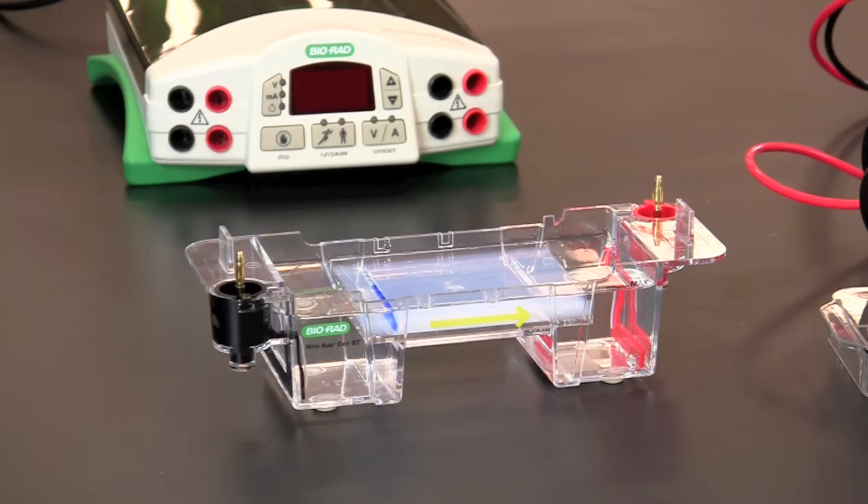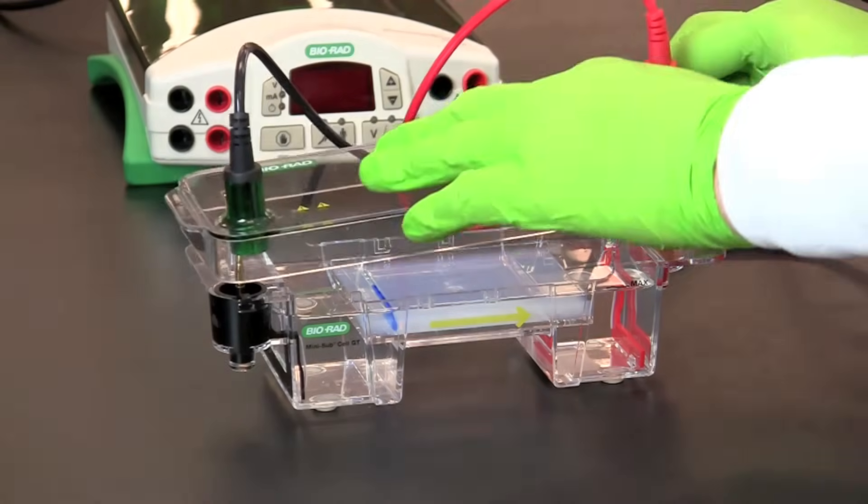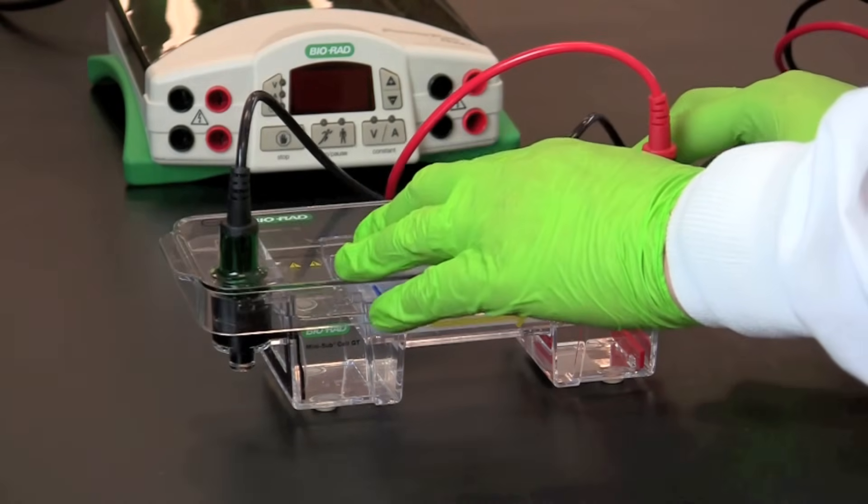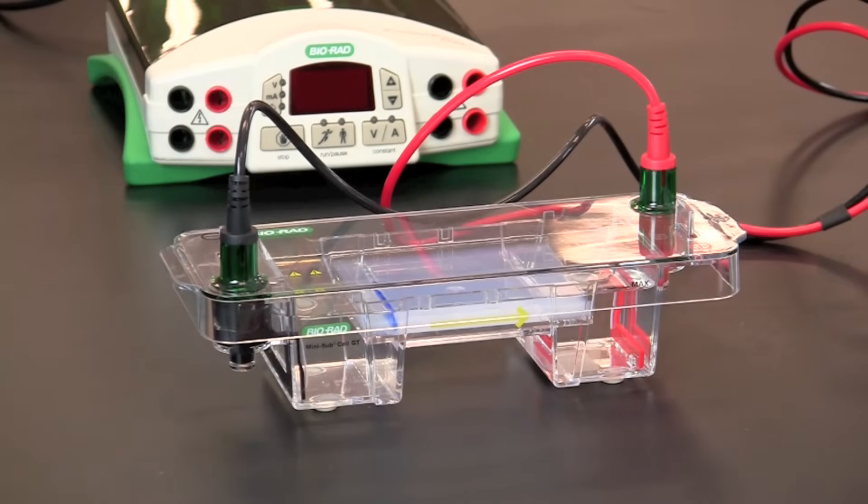Once all the samples have been loaded, avoid any bumping or movement of the gel chamber. This might result in the sample spilling into adjacent wells. Place the lid on the gel chamber with the terminals correctly positioned to the matching electrodes on the gel chamber, black to black and red to red.